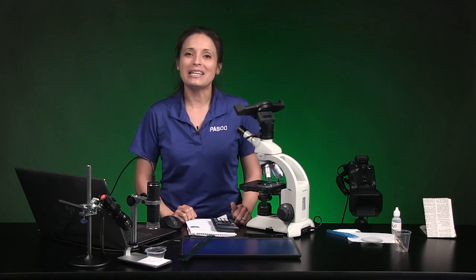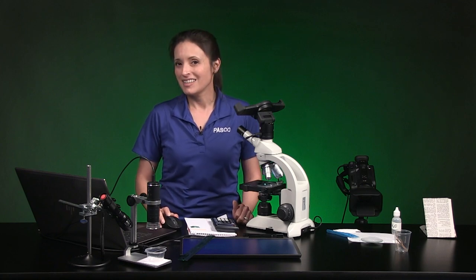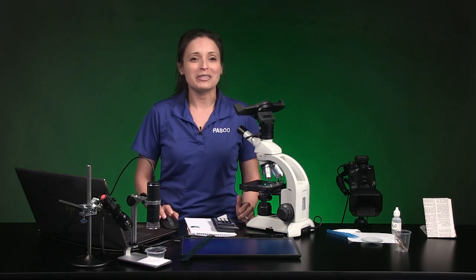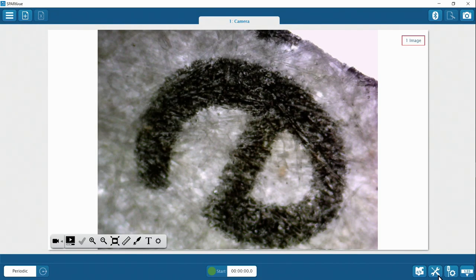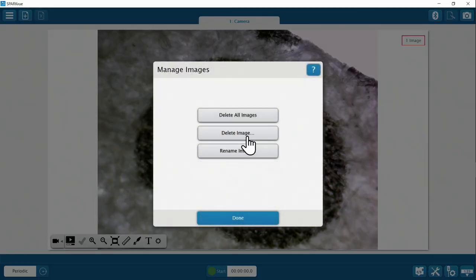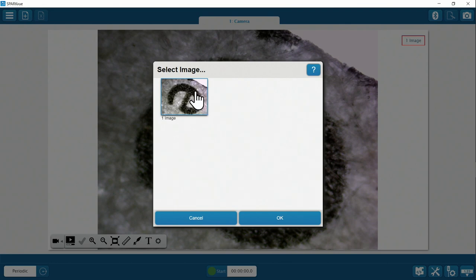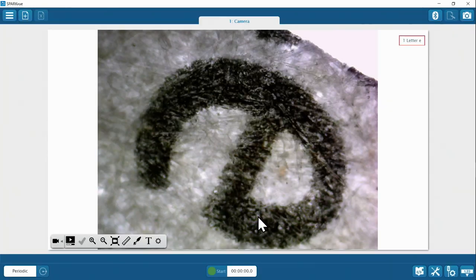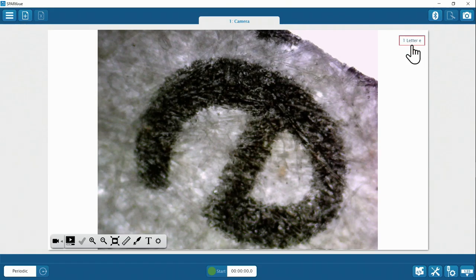In part three, you'll learn how to rename images and make measurements of your specimens in SparkView. Notice in the top right the legend says 'one image,' but you can change it to something more descriptive. Go to Experiment Tools — the icon where the screwdriver and wrench make an X — then go to Manage Images. Choose Rename Image, make sure the image you want to rename is selected with the blue box around it, click OK, edit the image name, and click OK. The number 1 stays to track image collection order, but the image name is updated.